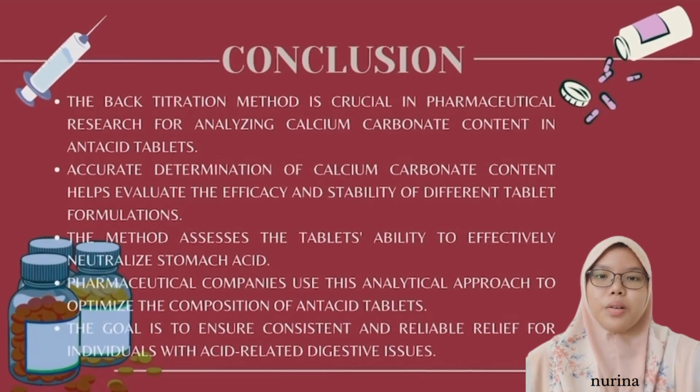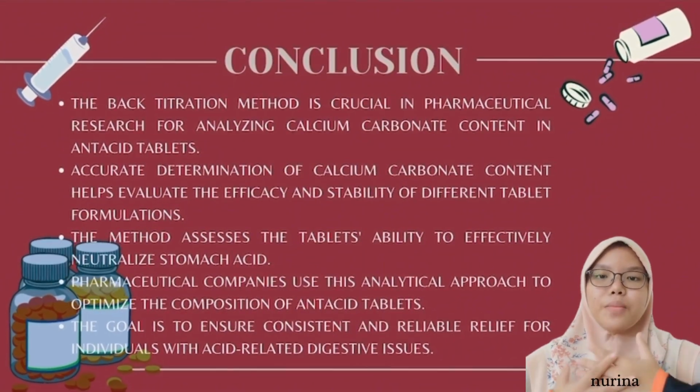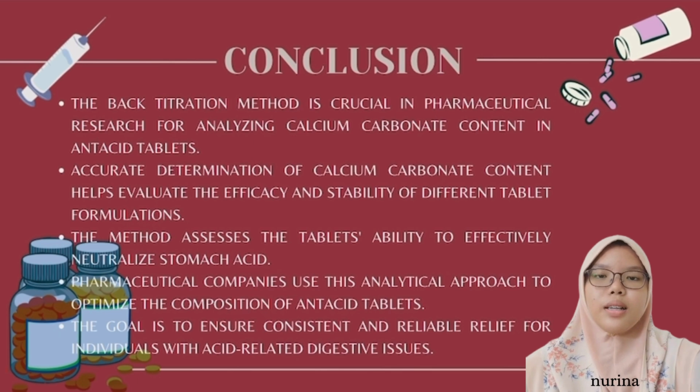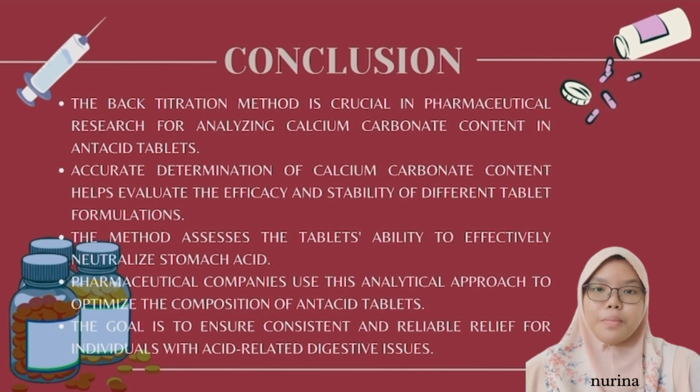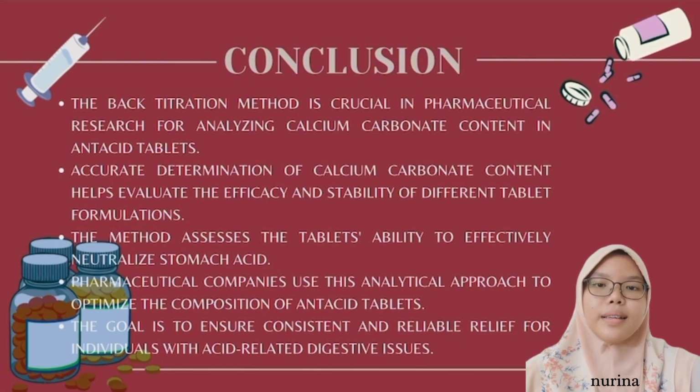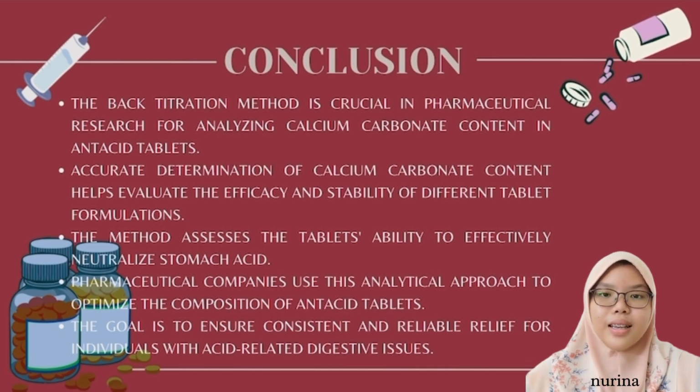I will be explaining the conclusion of our video presentation. In a pharmaceutical research and development laboratory, the back titration method for analyzing the calcium carbonate content in antacid tablets plays an important role in evaluating the efficacy and stability of different formulations. By accurately determining the amount of calcium carbonate in antacid tablets, we can assess the tablet's ability to neutralize stomach acid effectively. This analytical approach enables pharmaceutical companies to optimize the creation of antacid tablets, ensuring consistent and reliable relief for individuals with acid-related digestive issues.